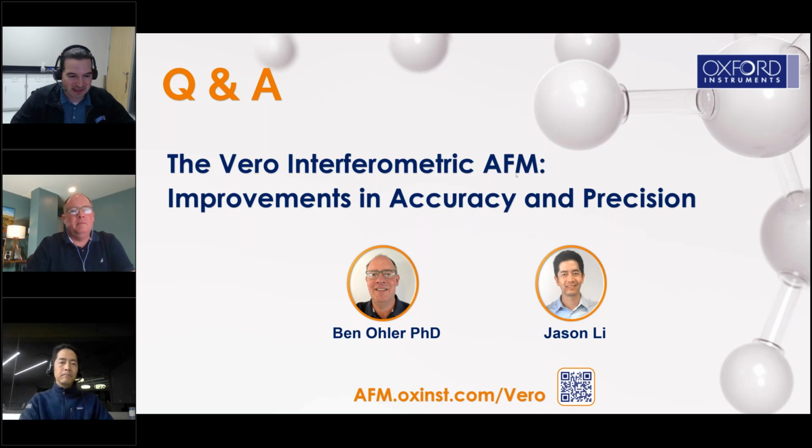Another question for Jason: what are the main differences between using Vero and a standard Cypher? Is it complicated to set up? Actually, they're quite similar in setup. Vero has a couple extra hardware toggles to select whether you're using a silicon or silicon nitride cantilever, plus whether you're working in air or liquid. But apart from that, it acts very much like a Cypher. And in some ways, it's actually quite a bit easier, because with Vero, since we have the interferometer built in, the calibration is a lot simpler.